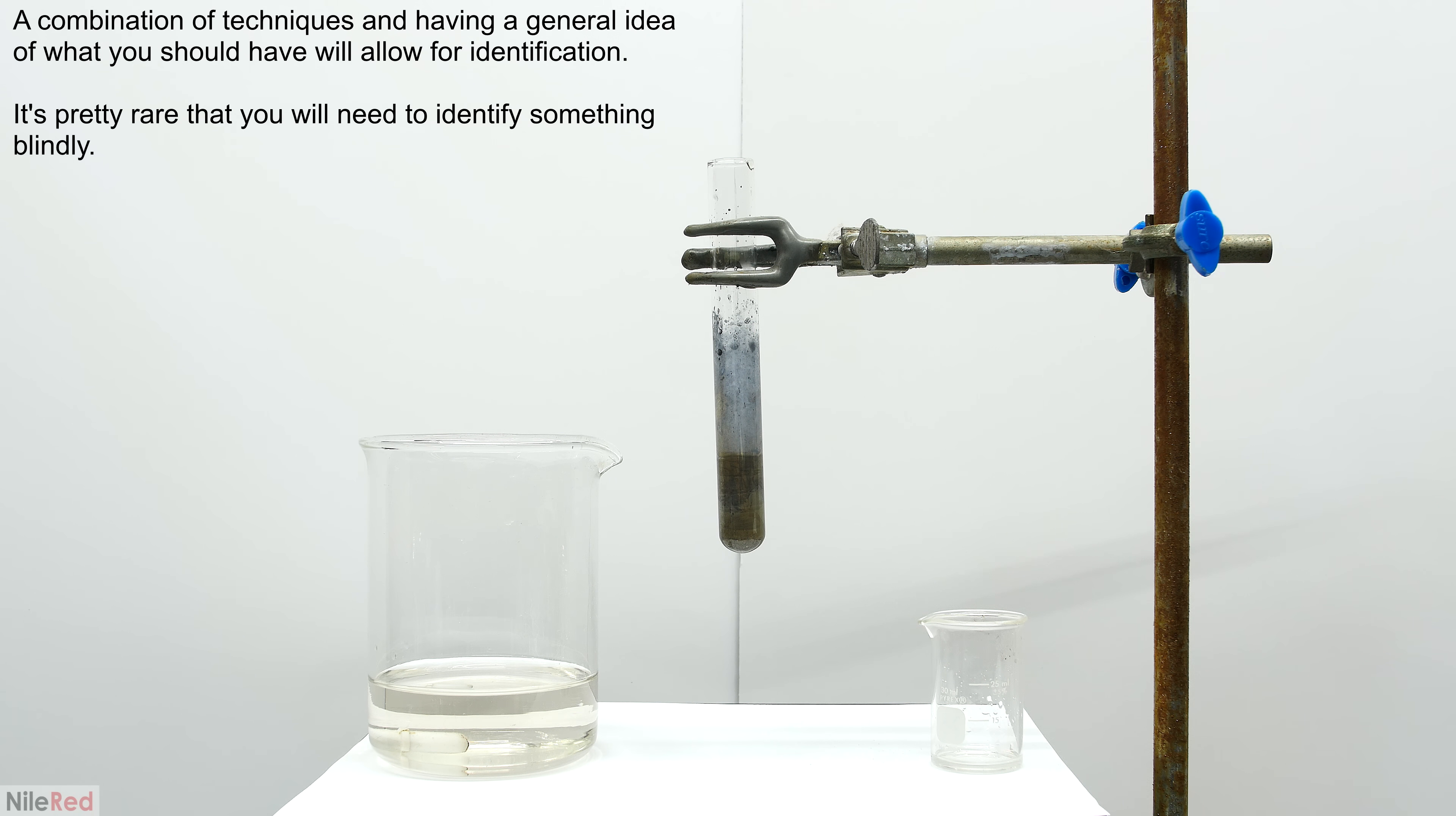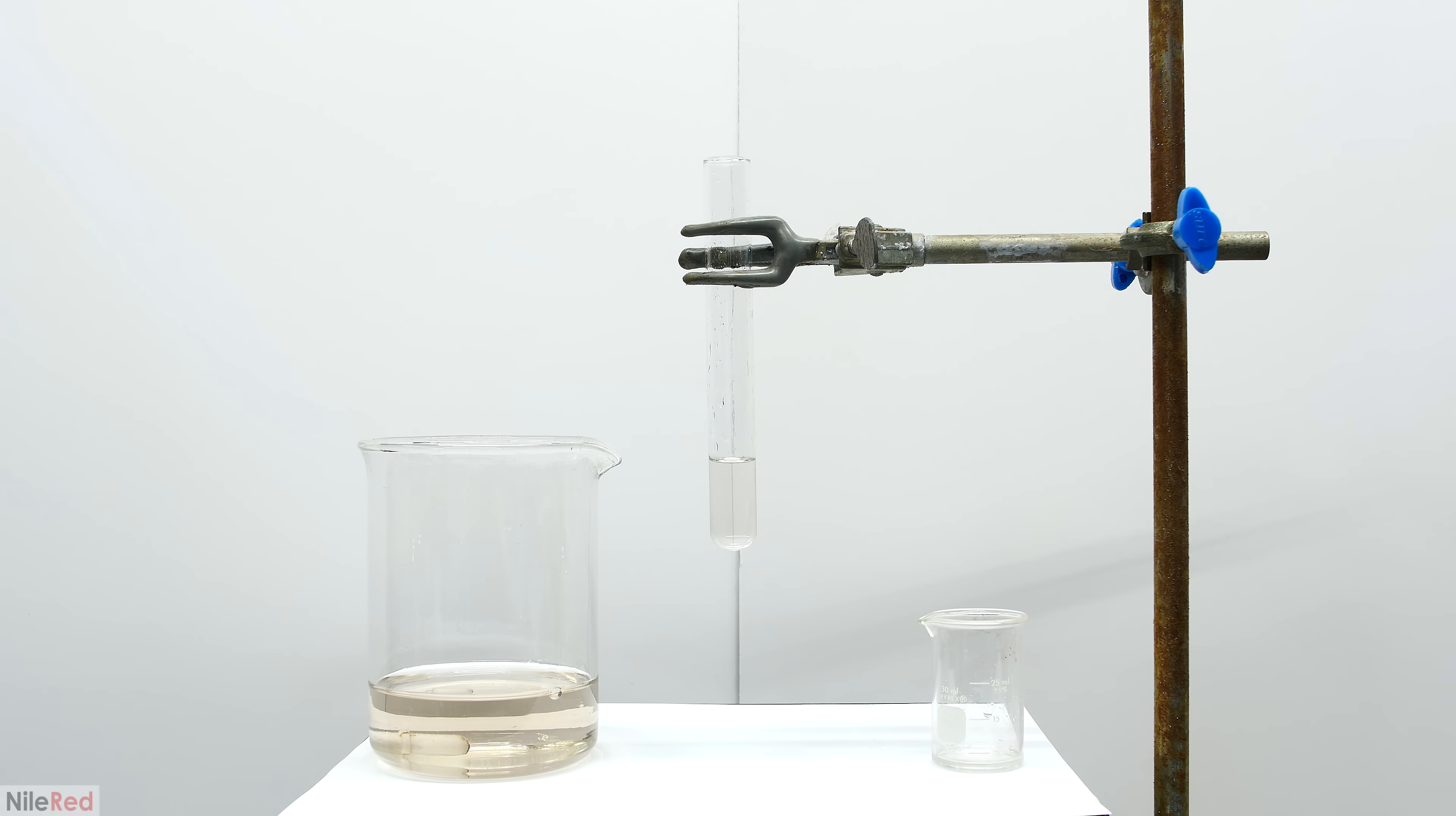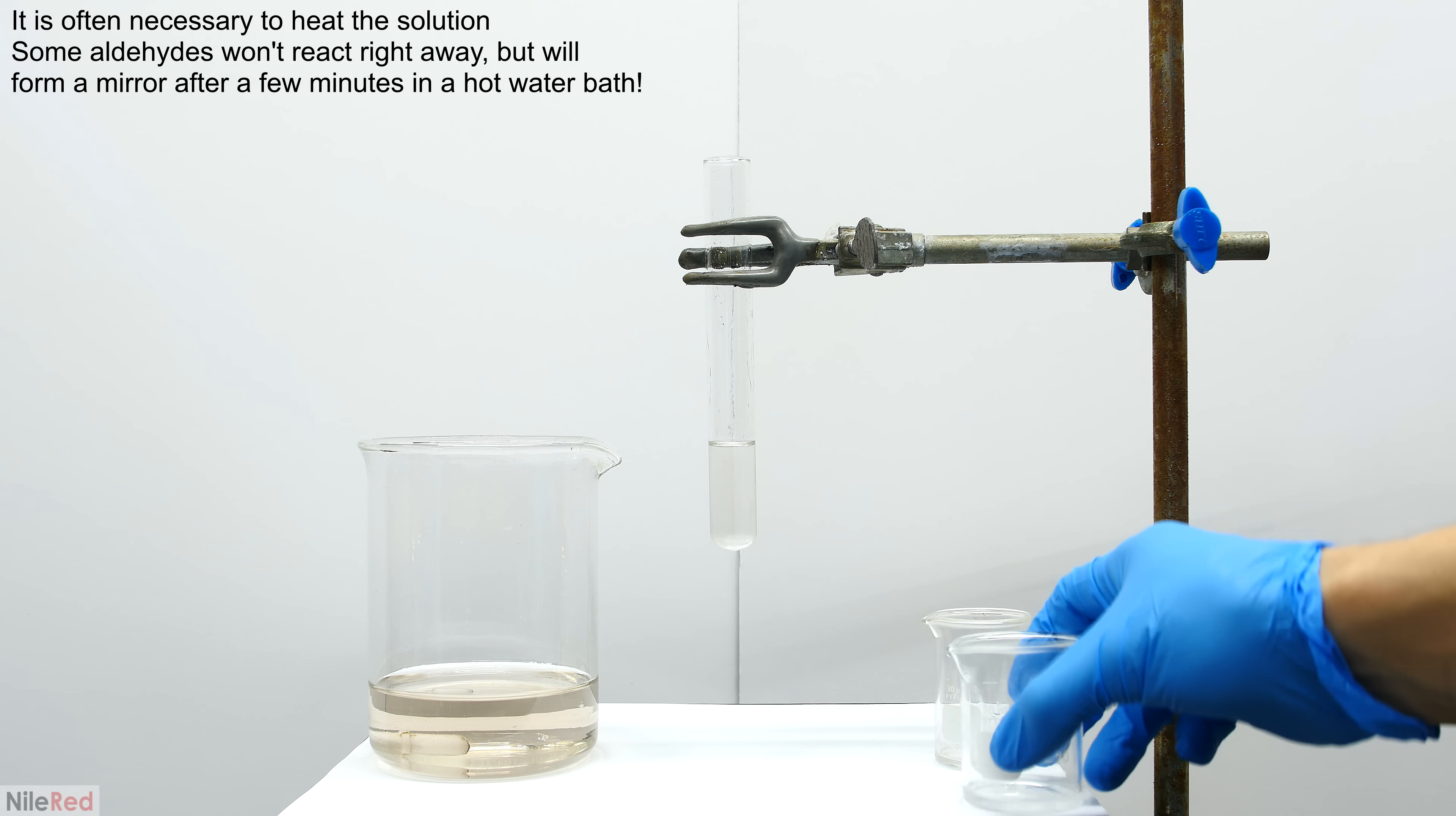A lot of these old-school methods used to identify functional groups need to be paired with other techniques. Now we can move on to the second unknown. It took me a few minutes between the tests, and you can see the Tollens reagent got even a little darker. Just like before, I poured in a bunch of the unknown, and I swirled around the test tube. This time, however, we don't form any colloidal silver.